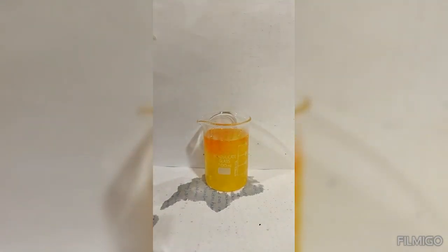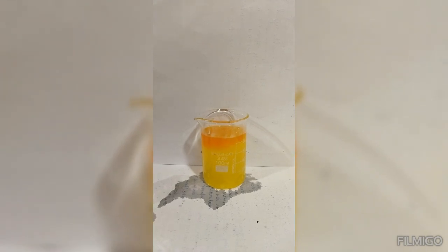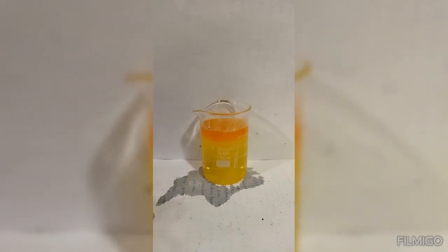Now, we add another excess of sodium hydroxide, and we see that the color is completely converted to yellow. That is the color of the chromate ion.